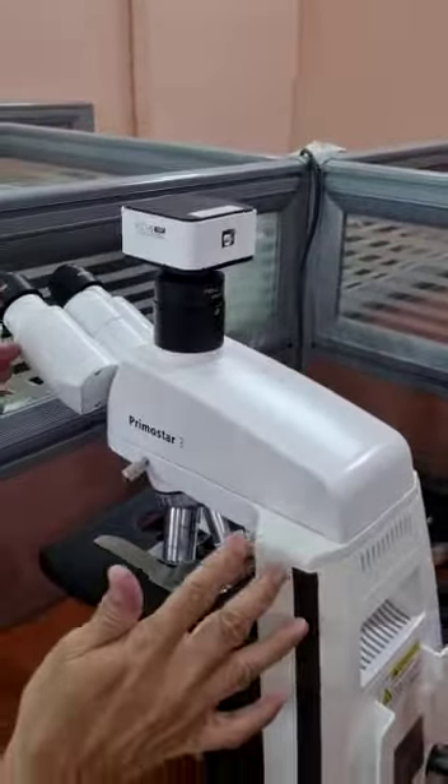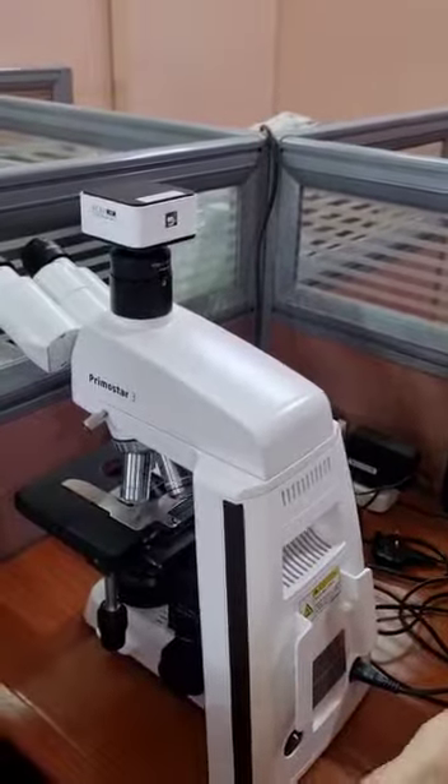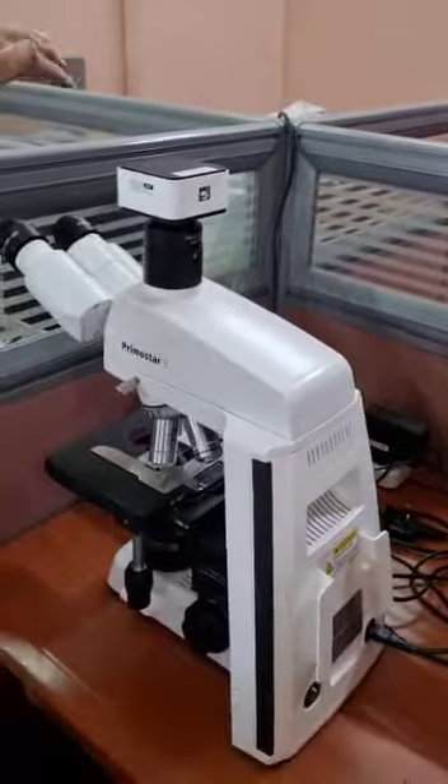This is the fixing of the camera on the microscope. Now connect the cable, put it to the computer, and start working with the camera and the microscope. Thank you.